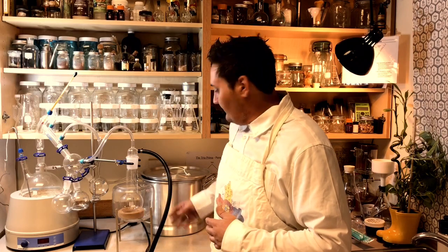So to begin the first video, I'm going to disassemble my still here, and I will have the pieces laid out on the counter, and then I will go through with you the reassembling, and we'll discuss each piece and its function. We'll put the vacuum grease on all the joints and some Teflon tape on the smaller joints here, and we'll fill up our chiller bucket here with some ice and some water, and we'll also put some dry ice in our cold trap, around the bottom of our cold trap.